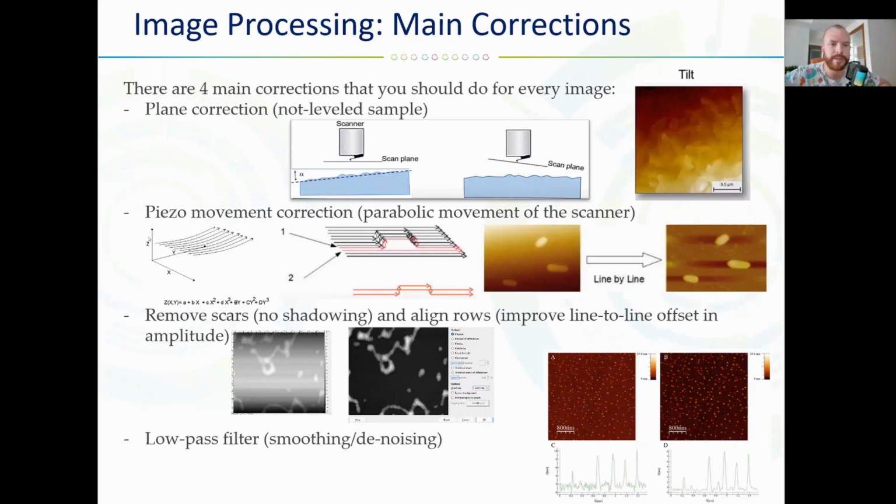It's a very stupid word, but align these two lines simply because we might have some displacement caused by temperature changes. 0.1 degree is enough. Just make your own calculations. For example, if you have steel, not even silicon steel, for steel the thermal coefficient is about 10 to the minus 5, 10 to the minus 6.